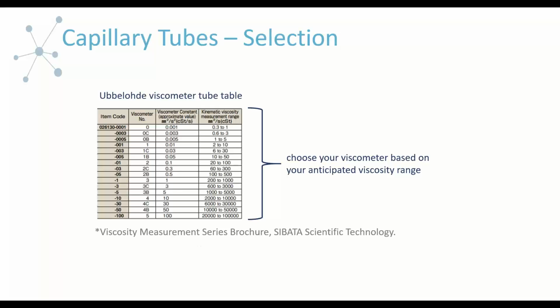What you would do is go to the table and look at the viscosity range, find the viscosity range you want to operate in, and then this guides you to a particular tube with a particular viscometer constant, which we just defined, and then it guides you to select the right viscometer, which they have coded here. So the idea is that's the straightforward process: you want to choose your viscometer based on your expected viscosity range.